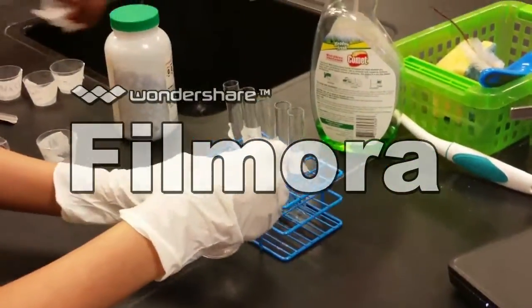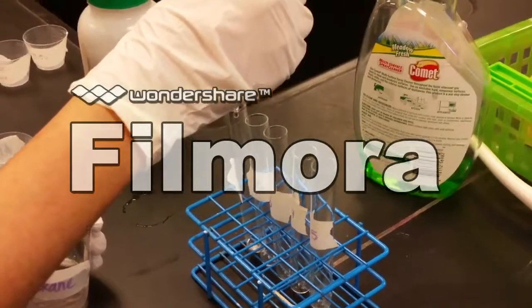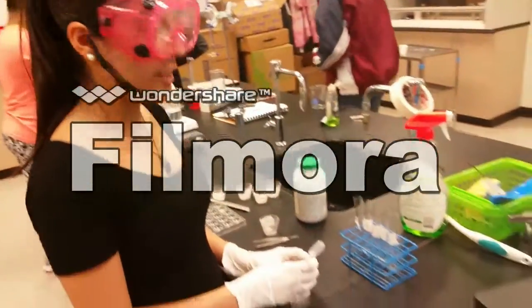Okay, so next we will be testing each solid in hexane. And now we're adding about 20 drops of hexane, and you're going to want to do this with each solid.